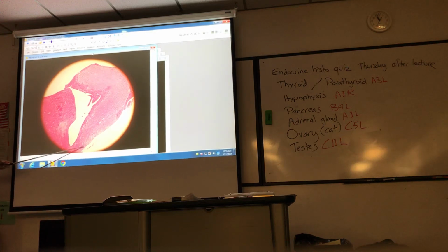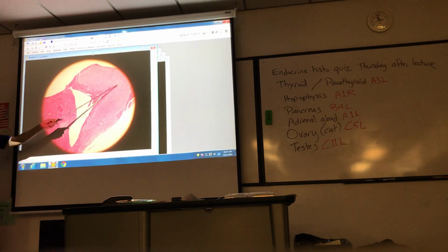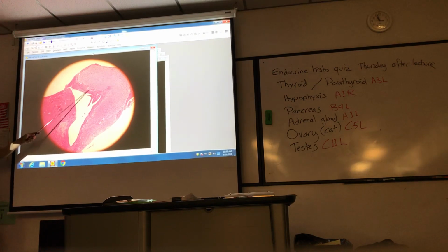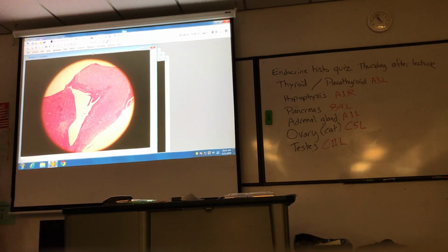The infundibulum is this small, narrow part up here. So infundibulum, which is continuous with posterior pituitary, anterior pituitary, pars intermedia. There's a big gap. Don't mind it, but basically, you're not going to be able to identify that. Any questions on pituitary? Pretty straightforward, that one.